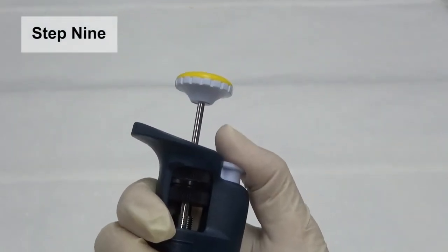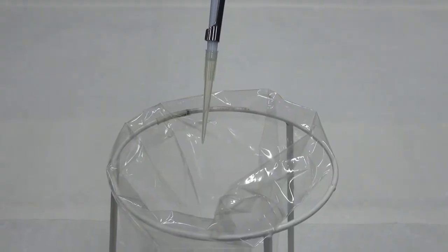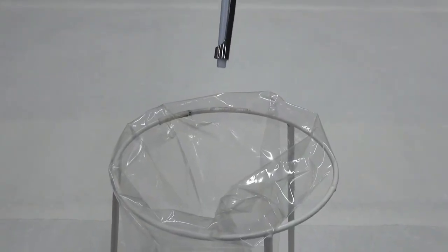Step 9. Press the tip ejector button while aiming at the trash bin for used tips to eject and discard the tip.